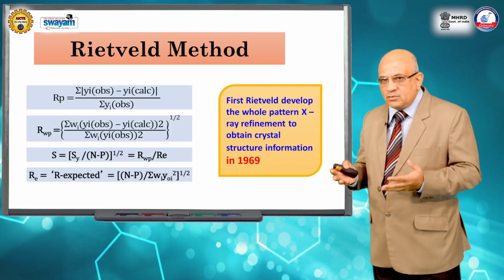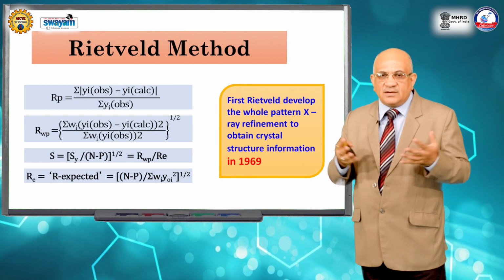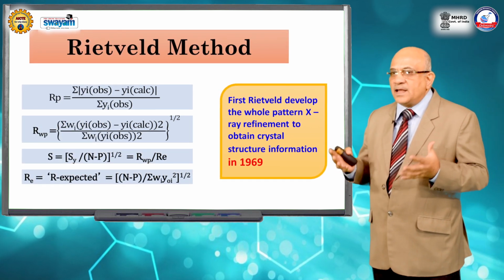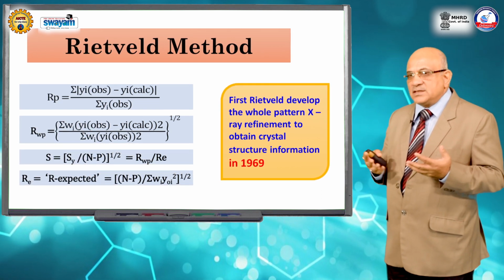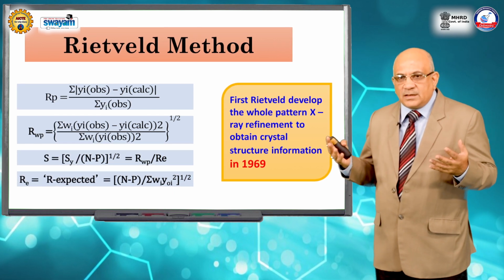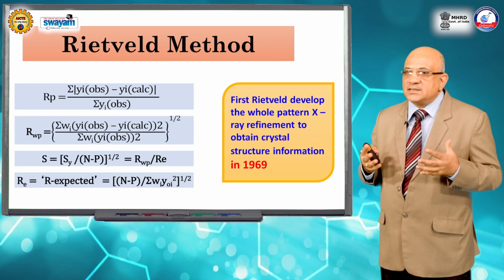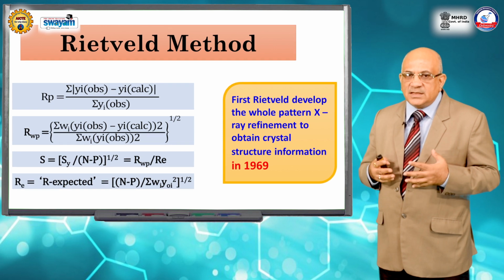There are several equations which you minimize using software, and it depends on the type of diffractometer and your choice of software. There are softwares which come with the machine, and there are free ones you can download. One has to learn by practicing the refinement procedures.